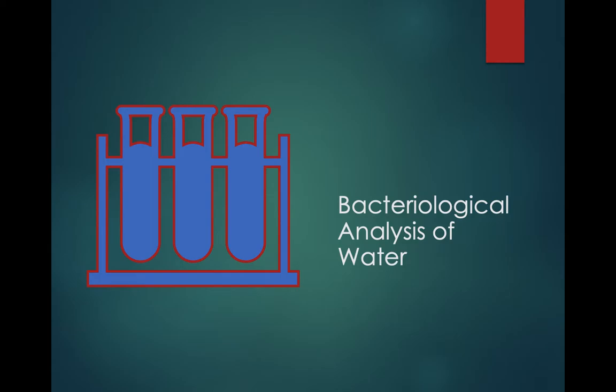Where we check on the growth of the microbes isolated from the water sample, whether they can ferment lactose, they can produce acid and gas, and when grown on plates, especially the selective differential medium, which is EMBA, we're able to appreciate how the colonies look like.